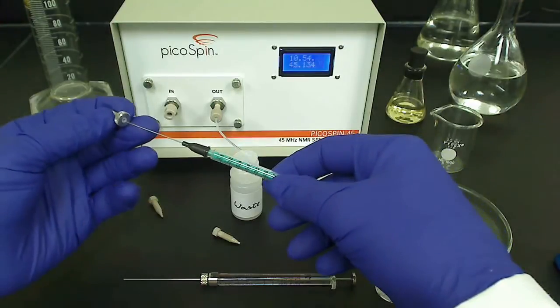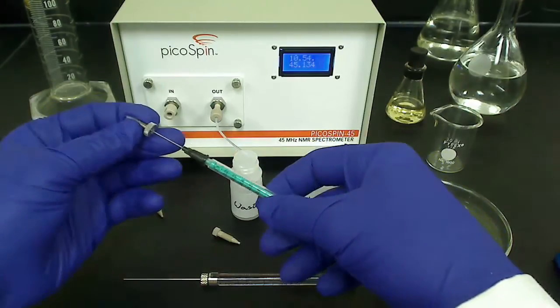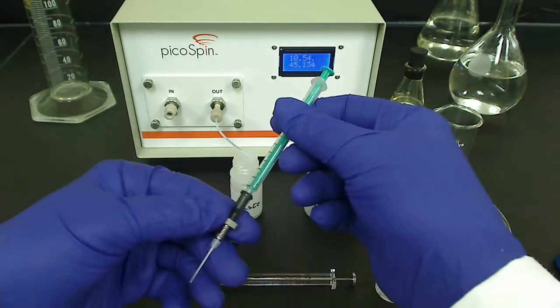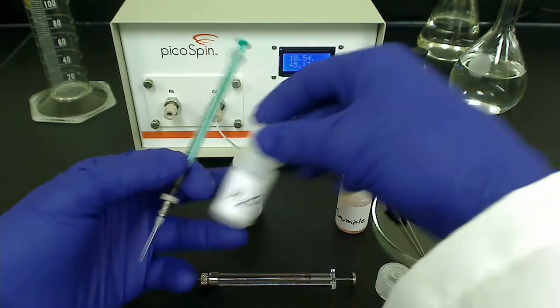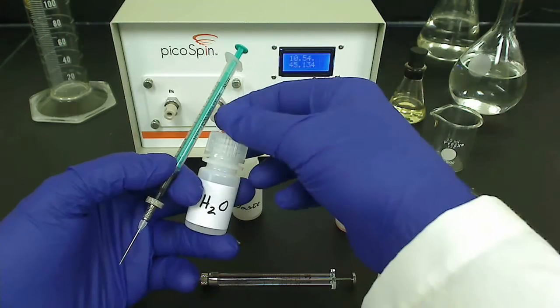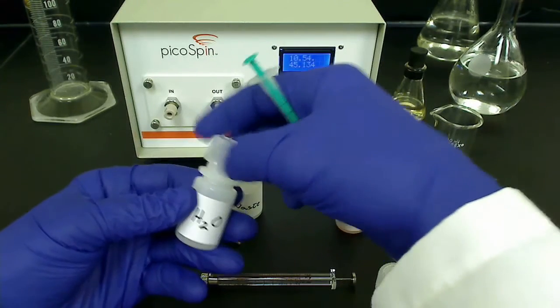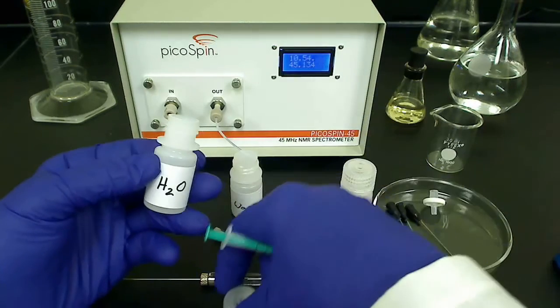Now, let's draw up some sample. I'm going to withdraw approximately 0.2 milliliters. The relatively large dead volume of the disposable syringe needle configuration results in air bubble formation behind the liquid. We'll need to take care to avoid injecting the air bubble into the cartridge. If this happens, just flush more sample through the cartridge.